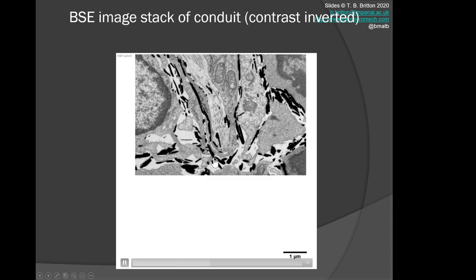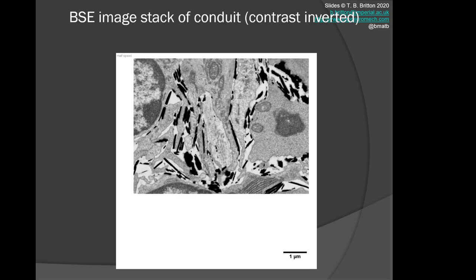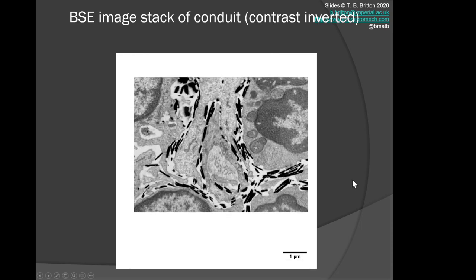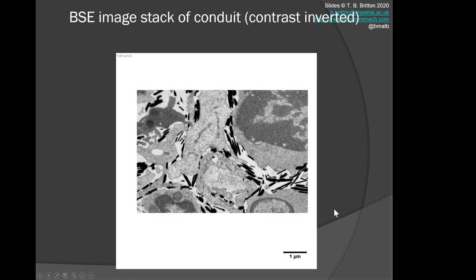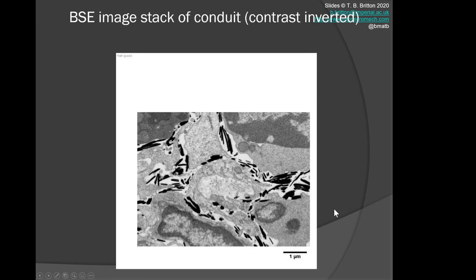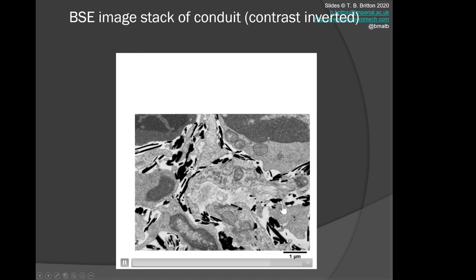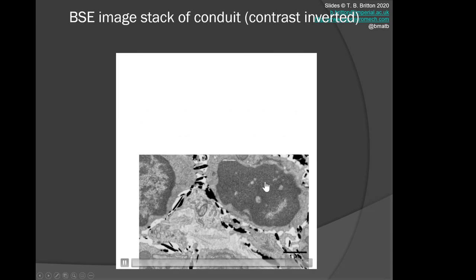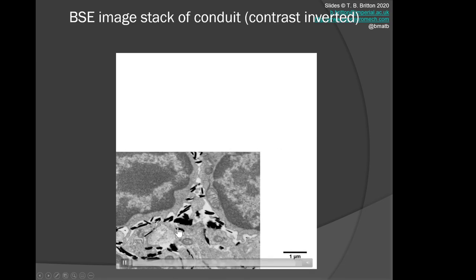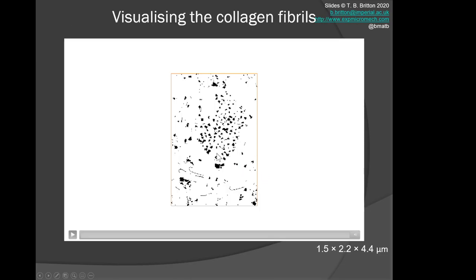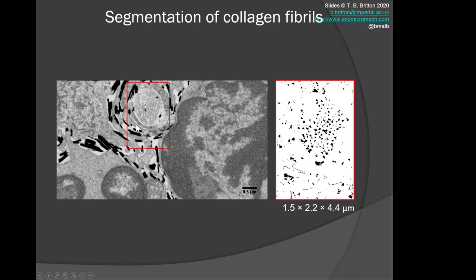These are then aligned—you can get them beautifully showing up in the alignments. The frame is moving slightly because the sample's moved and it's been registered to sit on top of each other. This is quite a lot of work to give you a flavor, and then lots of sitting and looking through those image slices. If we focus on the segmentation of the collagen fibrils, this is black-white segmented using a semi-automated algorithm to identify those features and label them. This is now looking at a relatively small domain within that micrograph.